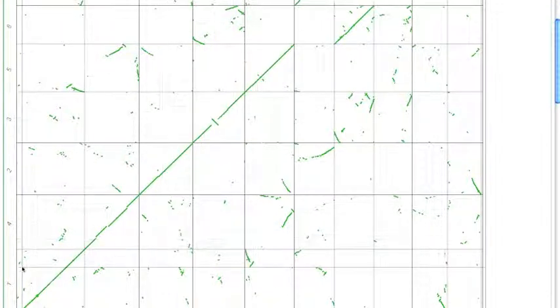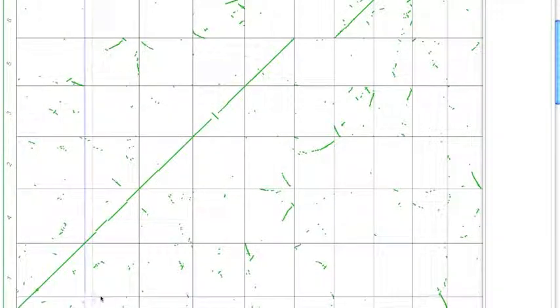This is due to identifying homologous or paralogous syntenic regions from the maize-specific whole genome duplication event, as well as very small syntenic regions from the grass-specific whole genome duplication event that happened prior to the radiation of the grasses. You'll also notice that as we look across this syntenic dot plot, the chromosomes are ordered not by their name, but by the physical size of the chromosome.